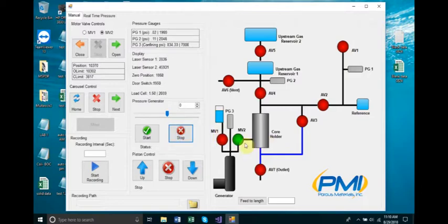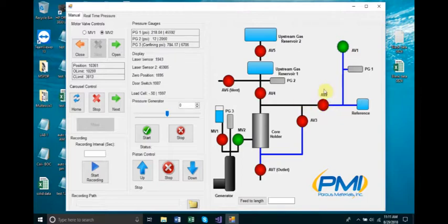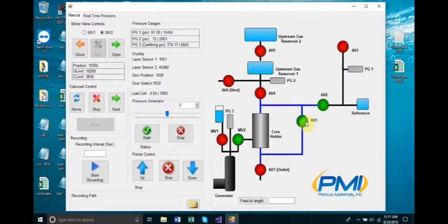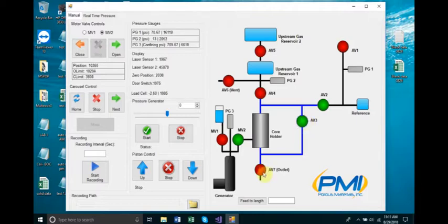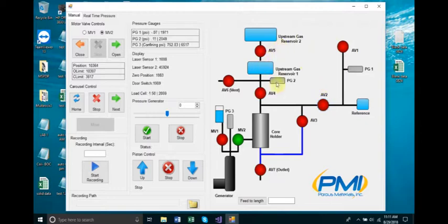The following steps allow the user to measure porosity. Ensure a gas source is connected, then open valve AV1 to flow gas into the reference volume reservoir. The real-time pressure is shown as P1. Wait for pressure stabilization, about 20 seconds. Then close AV1 and record the pressure as P1i. Open AV2 and AV3 to allow gas to expand into the core plug sample. After the pressure becomes stabilized, record the value as P1f. Open AV7 to bleed the system pressure. Once P1 drops to 0, close AV2, AV3, and AV7. Using the appropriate formula, calculate porosity of the sample.